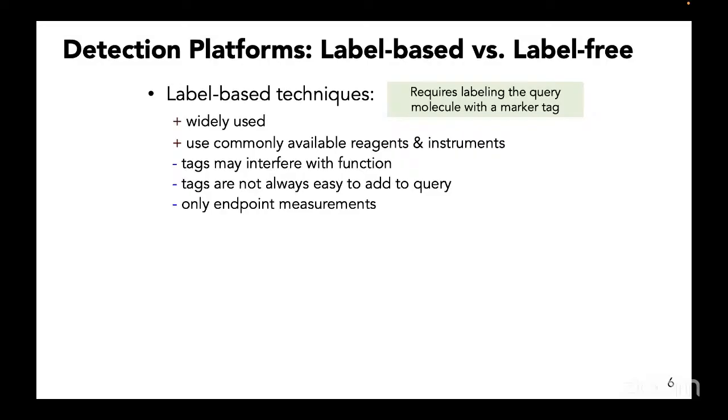These are very commonly utilized reagents which every lab has, and most of the time scanners are available which can scan the fluorescent reagents. So we see them used very commonly, whether in Western blot, other types of fluorescent-based scanning, and microarrays.